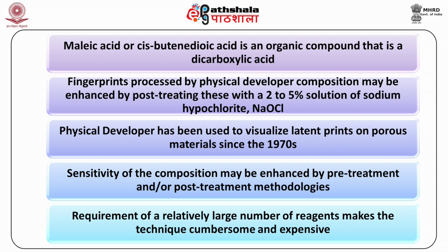Lastly, we have learned from this chapter that the requirement of a relatively large number of reagents makes the technique cumbersome and expensive.